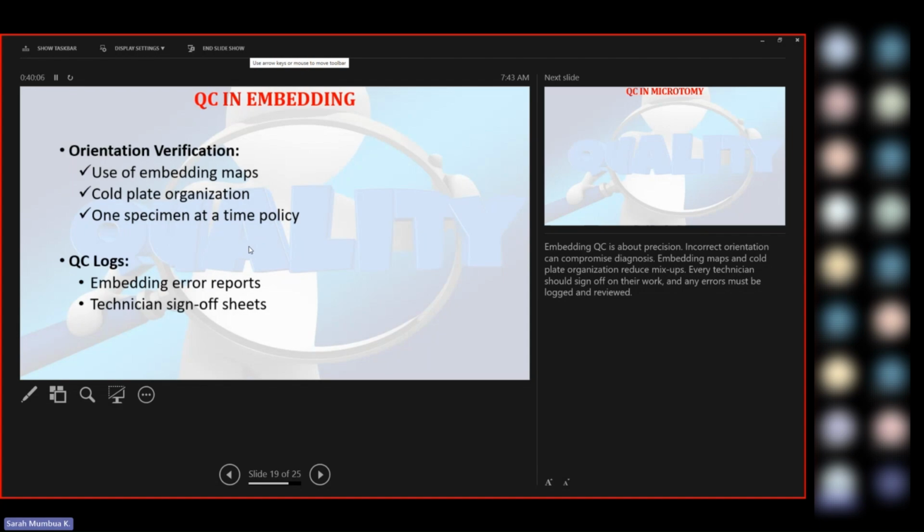Do not, for example, what I said about blocking on edge, and if you don't check on the tissue type, you do not do a correct work. So make sure you check if the tissue is, and these things are noted during grossing. During grossing, make sure to write notes. It's a tissue for blocking on edge. It's a circular tissue. It's a tiny tissue.